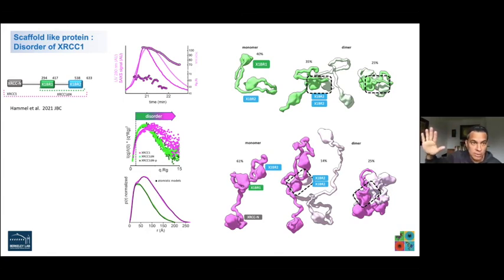It's completely worth doing, but you have to convince the Beamline scientists to do this, for one thing, or you have to apply for time. You have to apply for your own user time and do that with the Beamline scientists, right? Yeah. But it does work, and you can get some pretty amazing results.